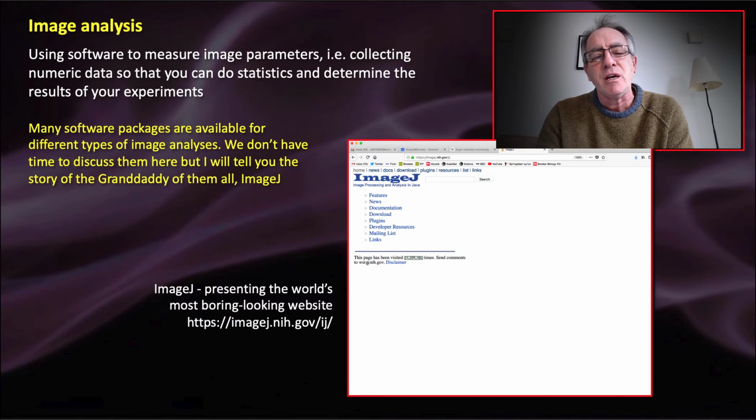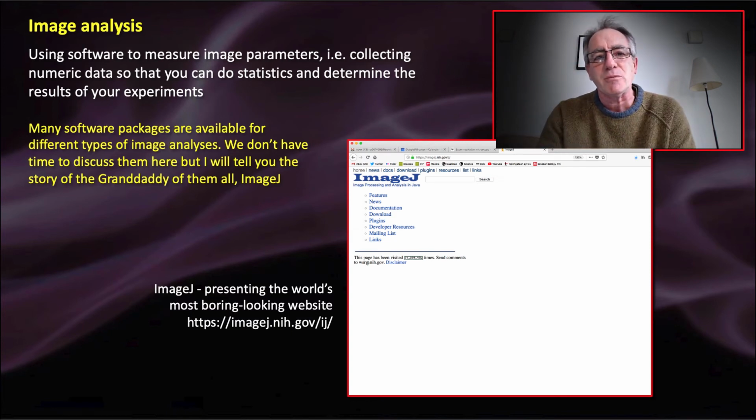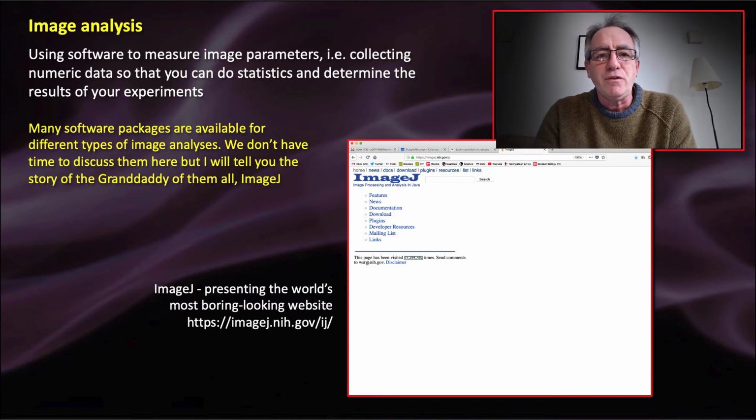Remember, another thing you do with confocal microscopy is optical sectioning, the so-called Z series, where you step down through a relatively three-dimensional specimen. You can step down through and make 50 or 60 or 100 different planes of focus, and you can do that in several different channels, a green channel, a blue channel, a red channel, for example. So that would be, let's say, 50 Z steps times 3 channels would be 150 images. You have these absolutely gigantic data sets.